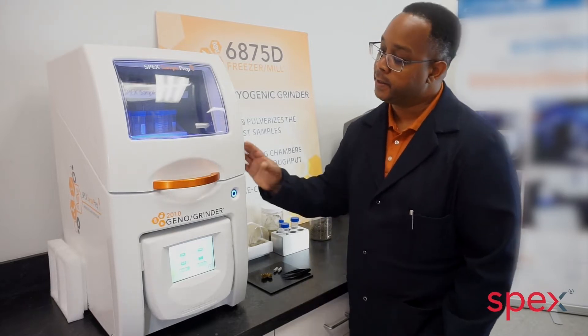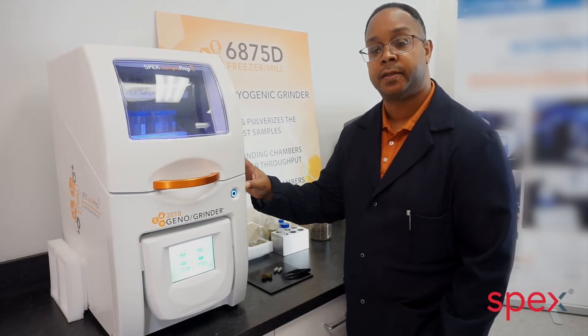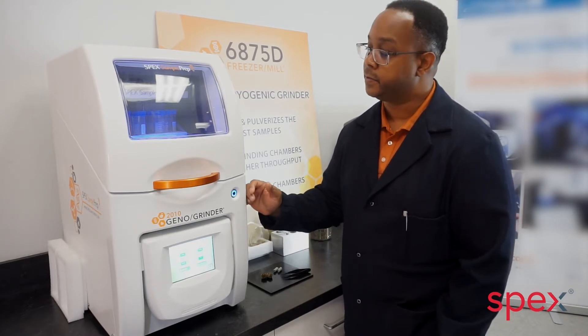Hi, I'm Eric Smith, the Application Scientist at SPEX in New Jersey, and this is the 2010 Geno Grinder — SPEX's high-throughput homogenizer, fully programmable with a touchscreen interface, designed to meet high demand from day-to-day use.